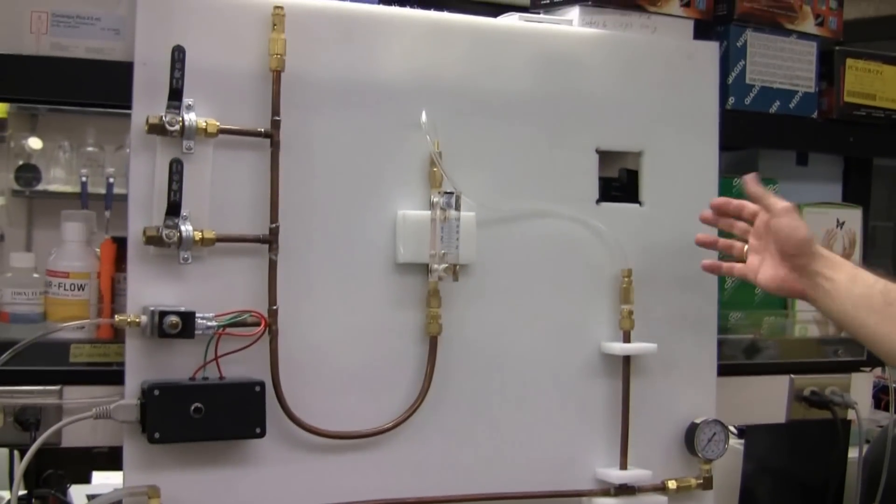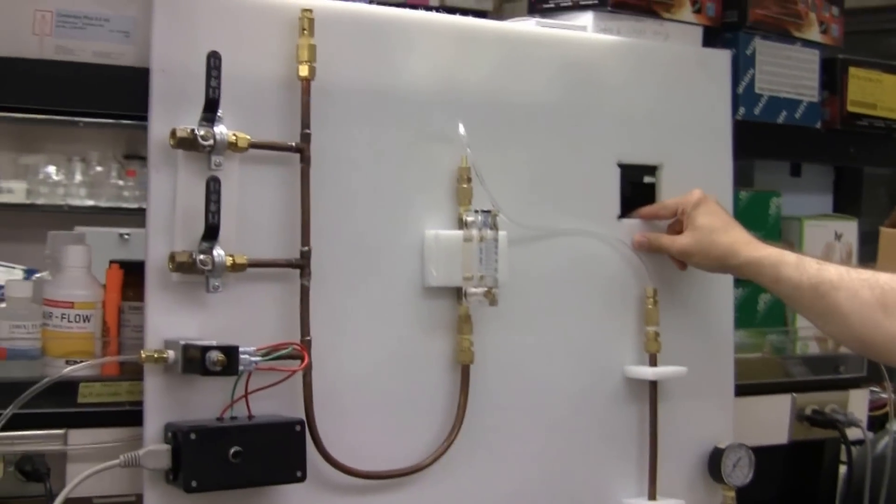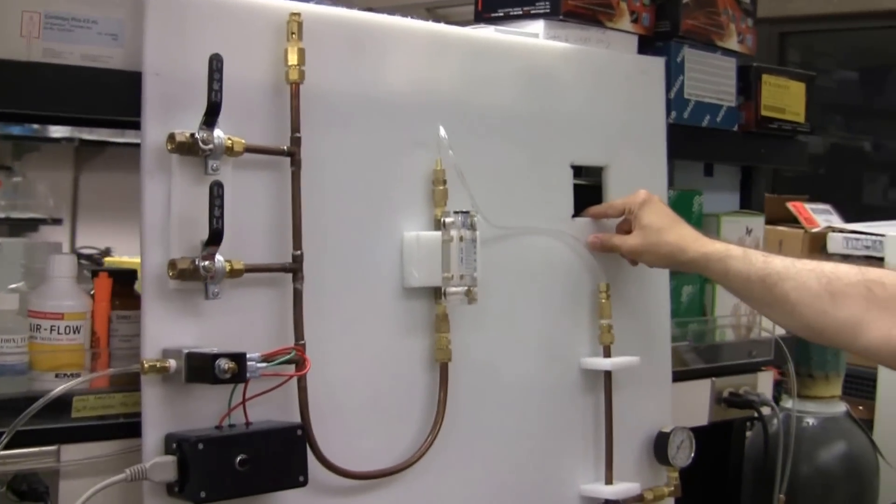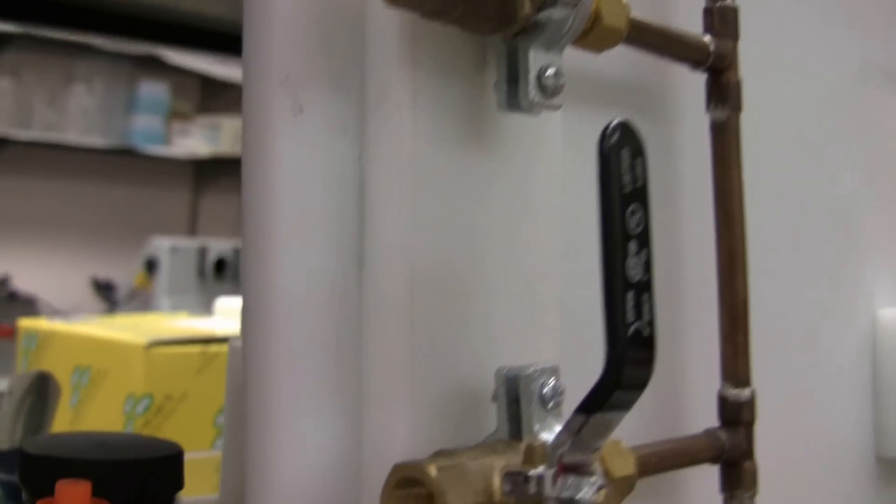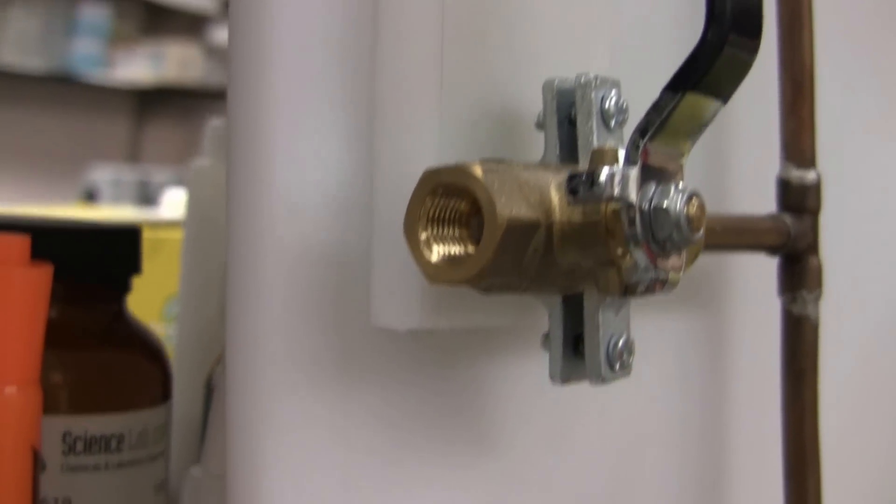It is built on sturdy, thick polyethylene. It's an inert material. It's not sensitive to wetness or any aggressive media in the laboratory.